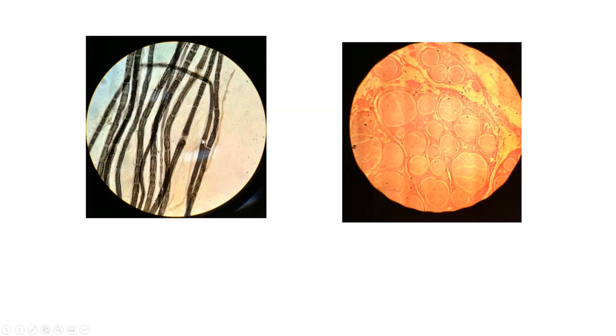This is a microscope slide of axons of neurons. What you're looking at here, that light spot right there—and you can see one here too—those are nodes of Ranvier on axons. You can see it looks like little sections; those light spots are the nodes of Ranvier. These would be myelinated axons.